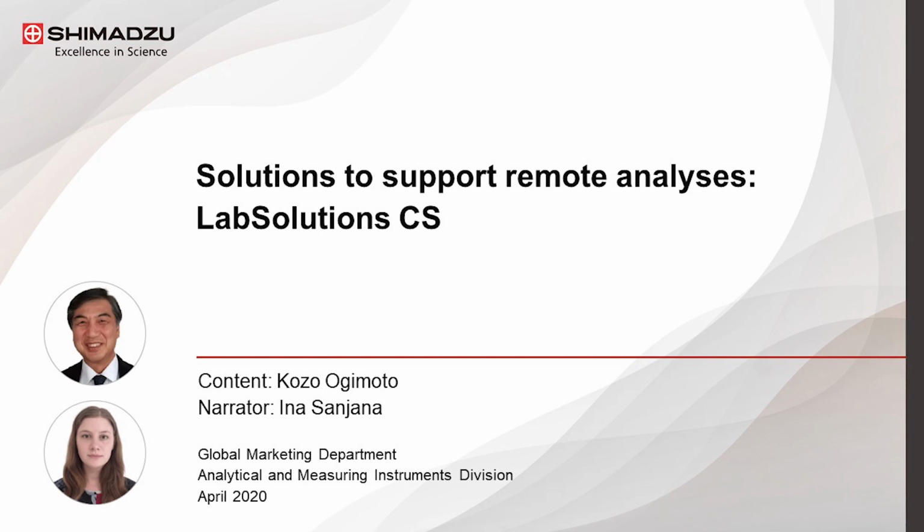In this webinar, I'll introduce examples of analytical workflows in a work-at-home environment that make use of Shimadzu's LabSolutions CS analysis network system.